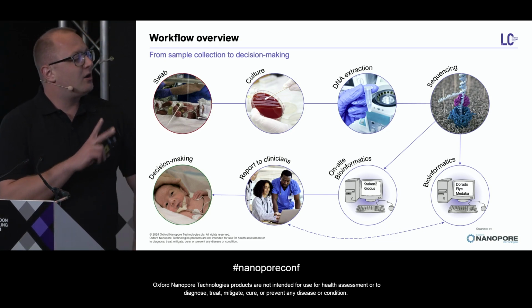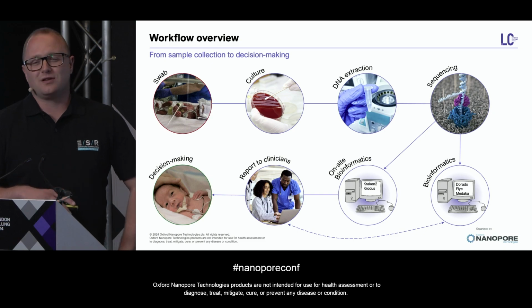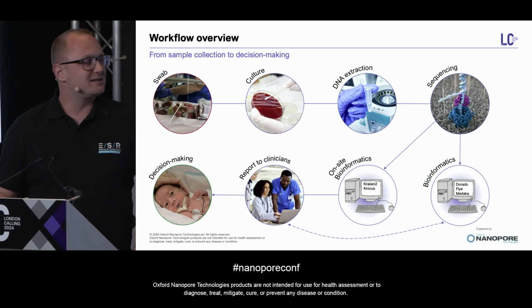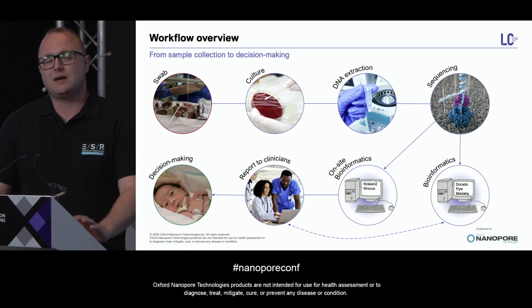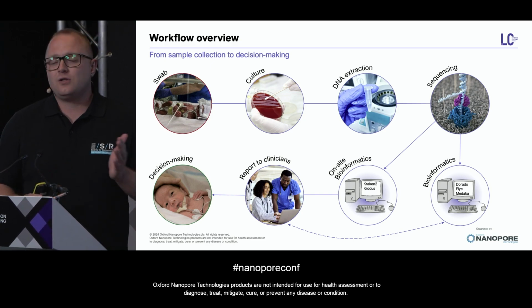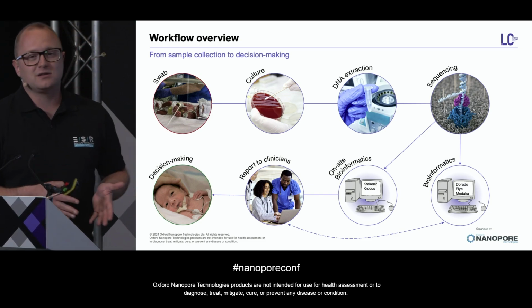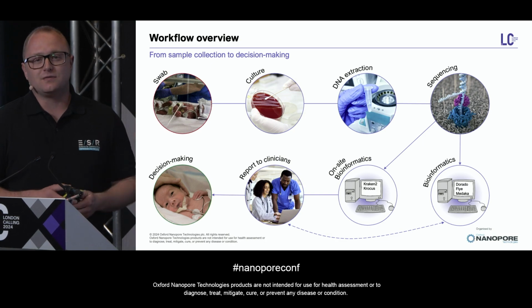Now, alongside that is where I come in, and to quote the clinician involved in this, I do the really nerdy stuff. We transfer the sequence data to our group at ESR, and we use some Dorado-based calling and a lot more in-depth analysis to do comparative genomics and phylogenetics. All in all, those two streams come together for a report that gets fed to the clinicians and the infection prevention and control team, where ultimately they can make better decisions for their patient care.